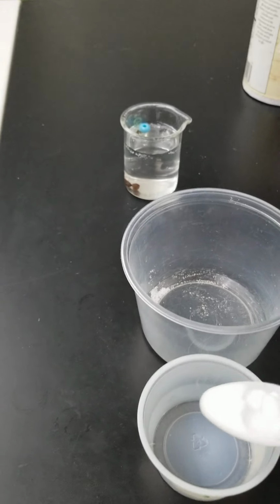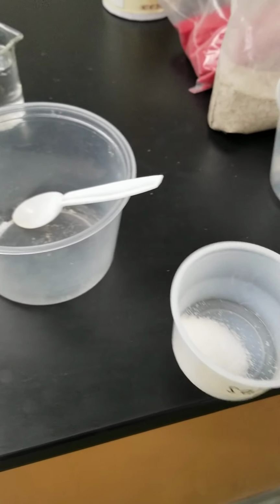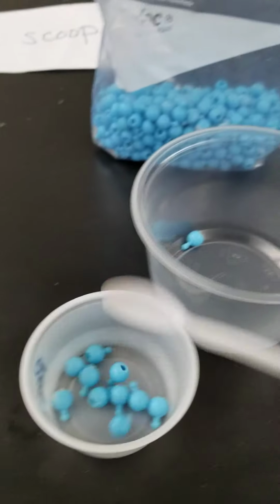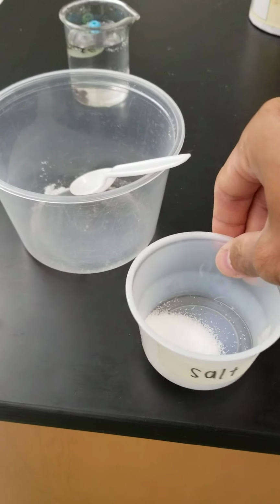The idea again is since we're separating it, we're just estimating about a teaspoon of it. So here's our sand, here's our steel nuts, here's our pop beads, and here's our pebbles. And for each one, I'm going to start measuring them.